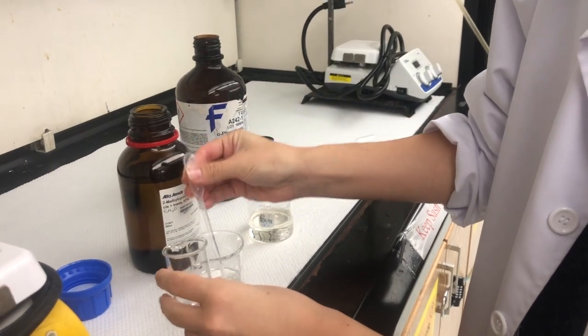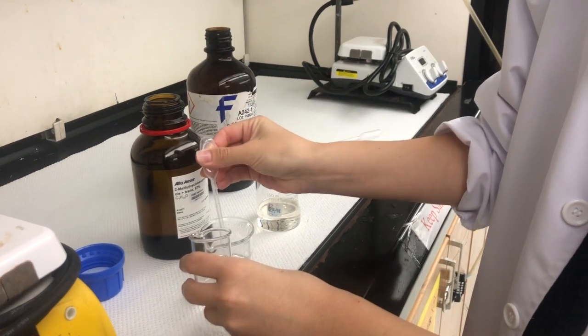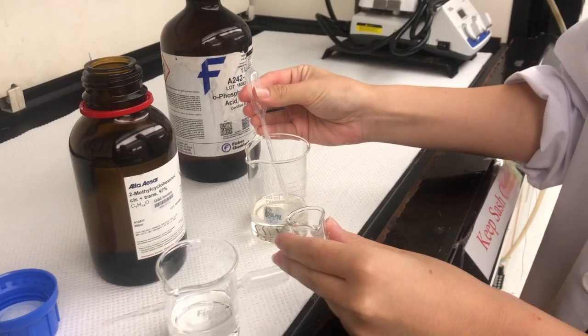Begin by gathering your necessary solutions. You will need 3 mL of 2-methylcyclohexanol as well as 1 mL of 85% phosphoric acid.